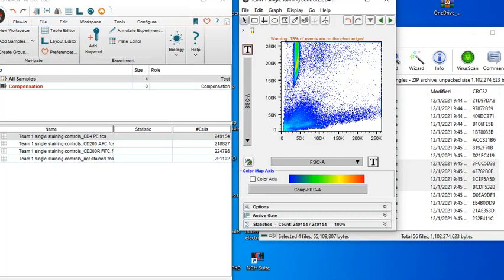When we talk about the beads, you have different ratios. You can see the screen is blue, and you're wondering what this is. This typically makes reference to the beads, the color of the beads. From here down, these are all apoptotic cells, dead cells, or debris. And as you move up and outside, these are cells that have high granularity. From here you have cells that are larger in size and all that. As you can see, what we have here is side scatter, and what we have here is forward scatter.